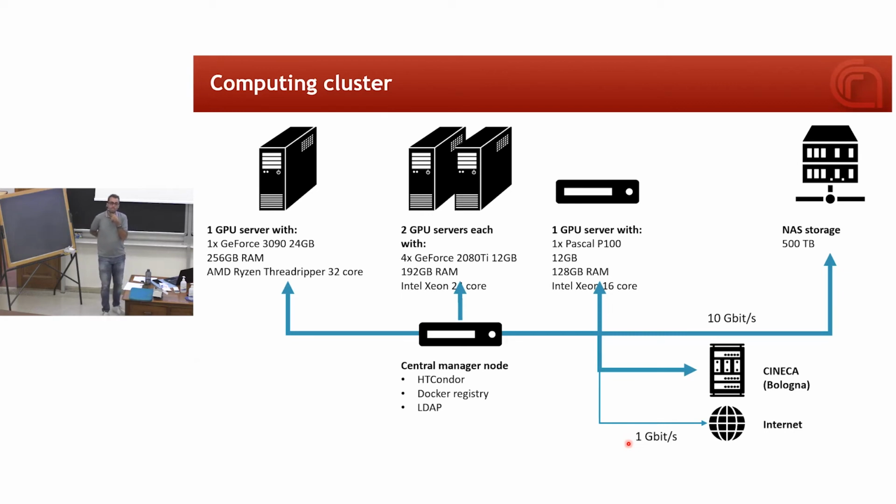So the problem with neurons is that I can't remember how many neurons there are in the human brain, but billions. And synapses are a power of this number, so it explodes very quickly. I think it's possible to map the individual neurons in the whole mouse brain. It's like 50 or 60 million neurons, which seems a lot, but it's not. If you were to place the coordinates X, Y, and Z in a text file or a binary file, it would be 100 megabytes. Every neuron in the whole mouse brain, ideally. 60 million, it's not that much.